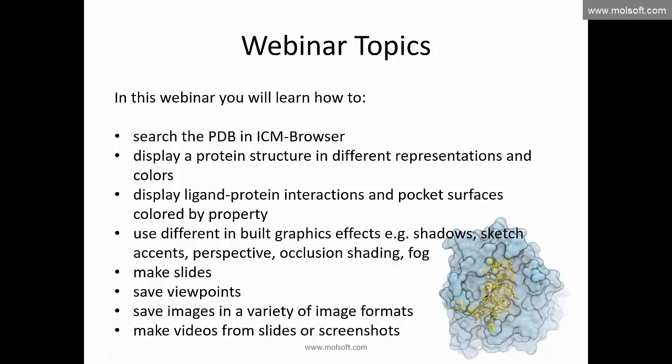Today's webinar topics include: searching the PDB in the ICM browser, displaying protein structures in different representations and colors, displaying ligand-protein interactions and pocket surfaces colored by binding property, generating different graphics effects like shadows, sketch accents, perspective options, occlusion shading, fog, and lighting. We'll also cover storing structures in slides, which lets you store different ideas and always get back to the representation exactly as you left it, and saving viewpoints.